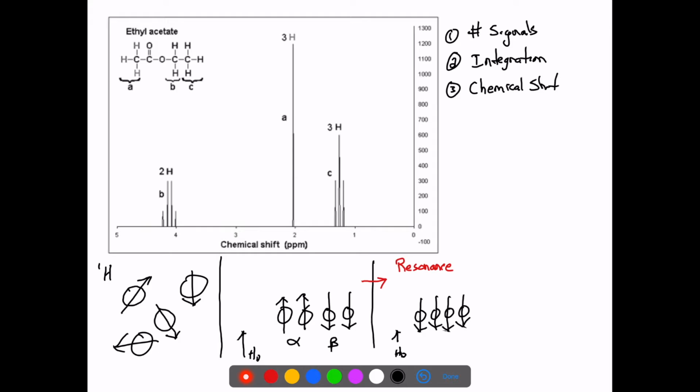Chemical shift is where these absorb here. Remember that C is a primary methyl in the end. It's typically between 0.8 and 1, but notice it's near an oxygen, an electronegative atom, so it's pulled downfield just a little bit. A, which is really close to this carbon double bonded oxygen, is pulled further downfield, and again, it's a single one, so it's a 2, even though it's a primary, it's down to 2.